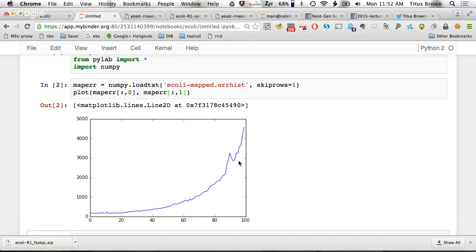So this is actually a really useful graph to show yourself, to convince yourself that there's not something really weird going on. So if you see a massive spike at position 20, and you're doing variant calling, you want to make sure that whatever is at position 20 isn't a problem. I still don't know what to do about those reads, but what I would almost suggest doing if you have a massive spike at one particular position is getting rid of all of the reads that have a mismatch at that position, because they're unlikely to help you. They're not going to help you in anything that you do downstream.